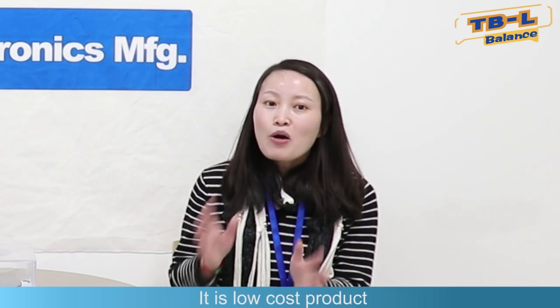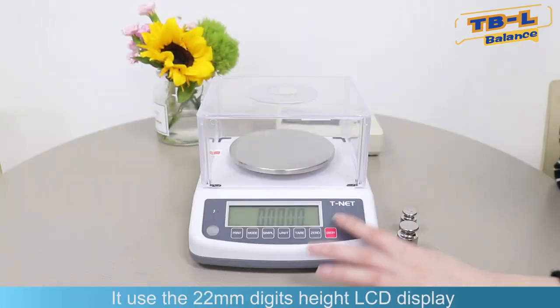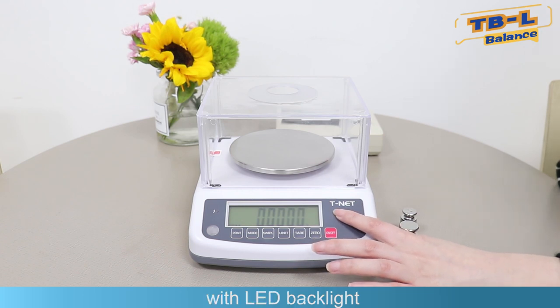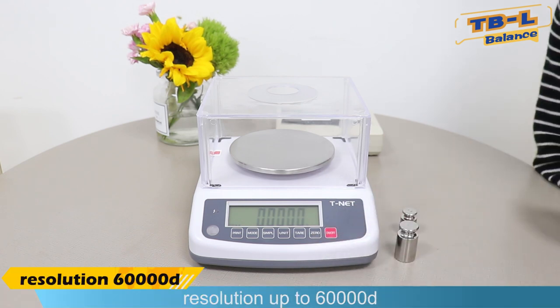The model name is TBL. It is a low-cost product. It uses a 22mm digit height LCD display with LED backlight. Resolution is up to 60,000 divisions.